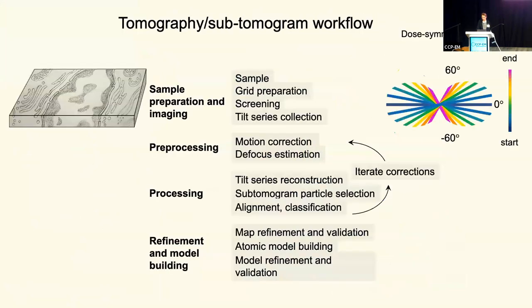And then the tomography workflow, this is trickier because tilt series are harder. Obviously it's nice that you can do it on a detector and not on film, but there's a lot of radiation damage accumulated. So we have dose-symmetric data collection, which makes it very effective. Then you have this good untilted data, and you use the lousy high tilt data to figure out more or less where things are in 3D, so that you can use the best bits for averaging if you can do subtomogram averaging. That's not so easy because you need tons of objects in the field of view, and your biological object of interest might not be in tons of copies, so that makes it hard.